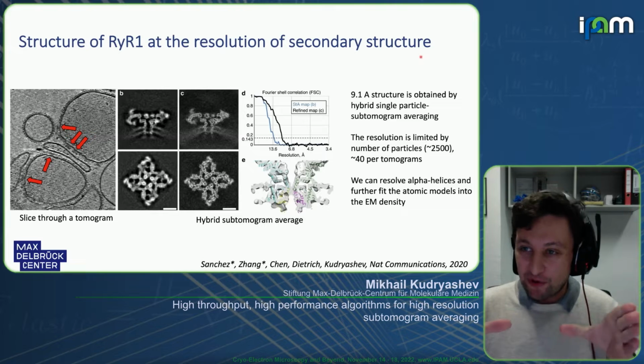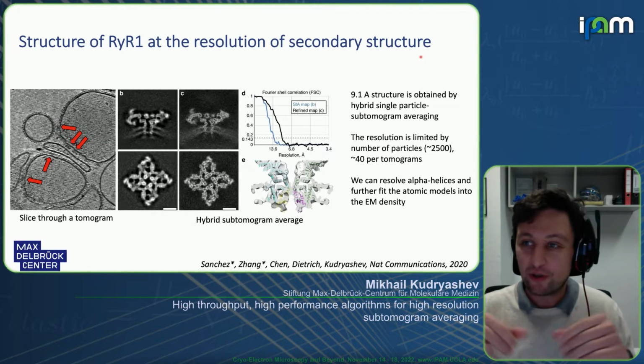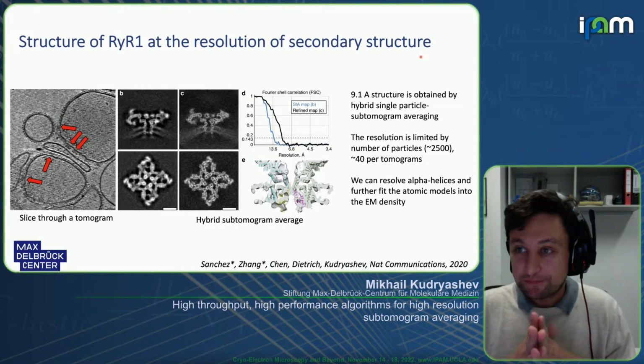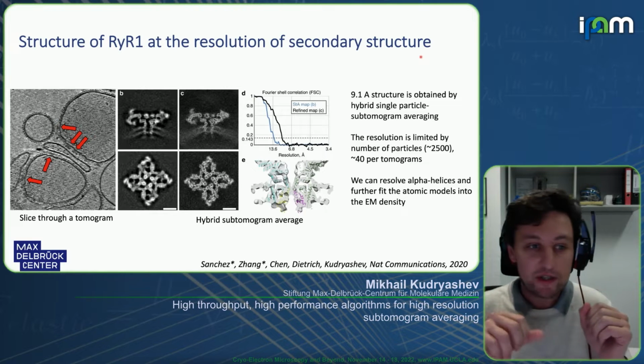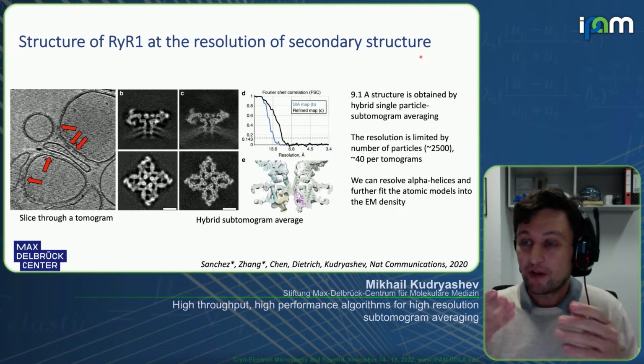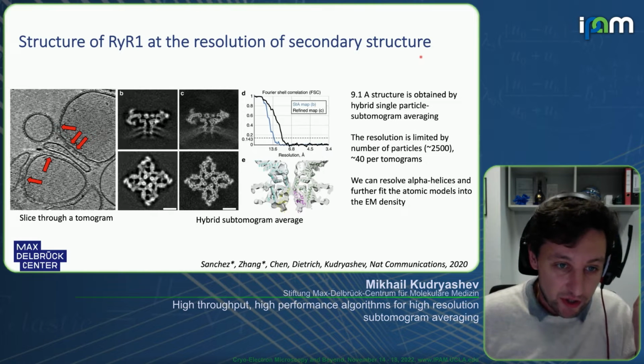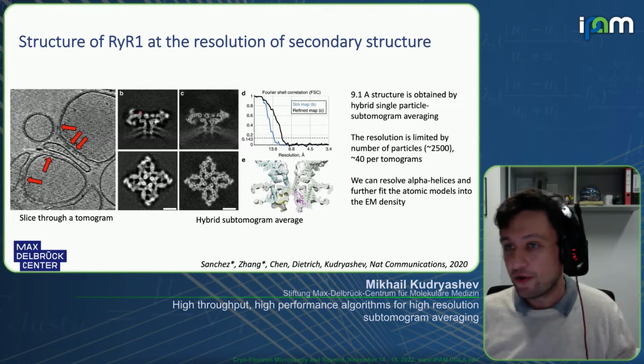So we do need tomograms to be able to identify the particles. After recording a so-called high-dose image, we then record a tomogram with the same optical settings. Then we incorporate the high-dose image into the tomogram, and perform subtomogram averaging as we usually do. Here you can see the structure in B, it's also 13 angstrom.